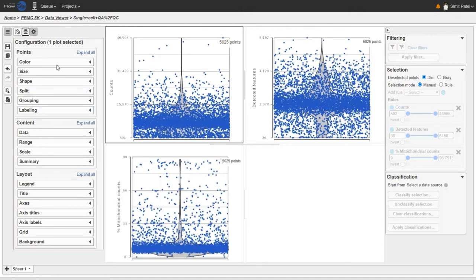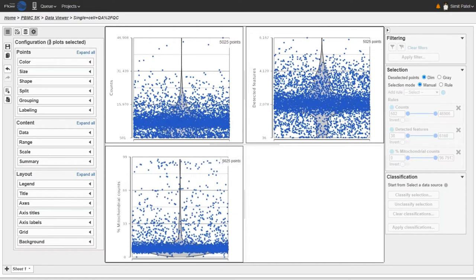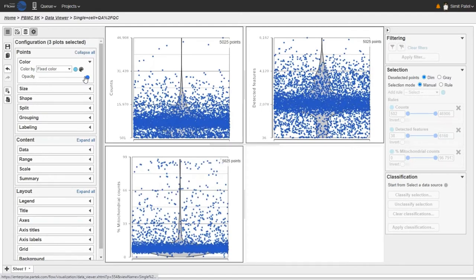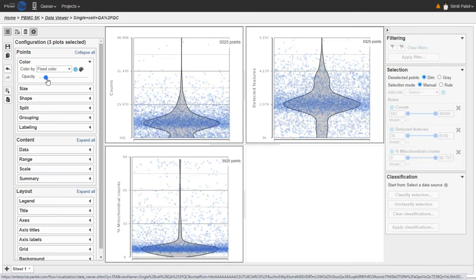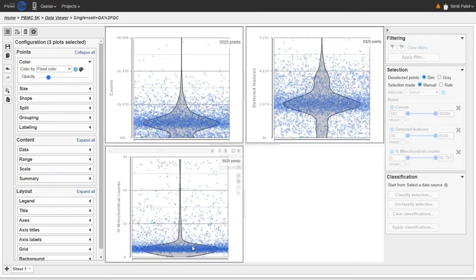I'm going to select multiple plots — holding Control to select all three plots. The first thing I want to do is change the coloring to reduce the opacity. This makes the dots more see-through, which can help us get a better idea of the density and how many dots are sitting on top of each other. This also reveals the violin plot underneath, which shows the shape of the distribution. The point where the violin plot is widest indicates the point on the y-axis where most of the dots are located.